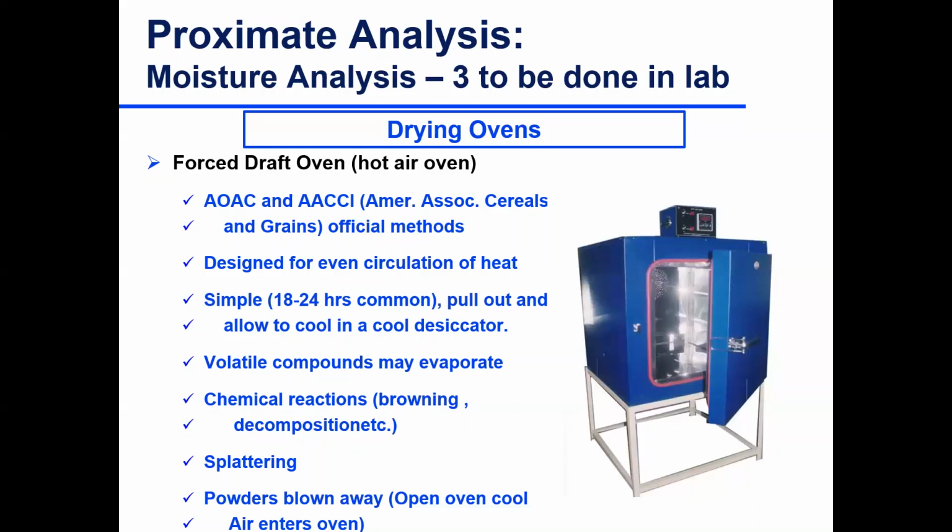This is a special oven, obviously. It's not like tossing it in any oven. These ovens are designed to have uniform heating, uniform airflow through them. They're a forced-air oven. And so even heating, even circulation, so I could say don't toss it in any oven. You have a special oven that's designed for the purpose.